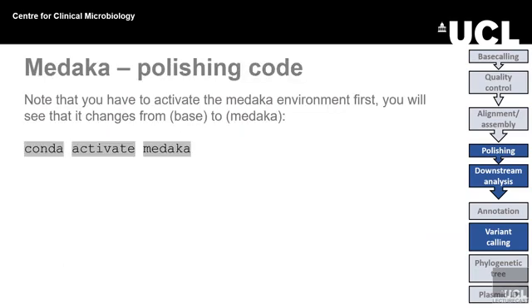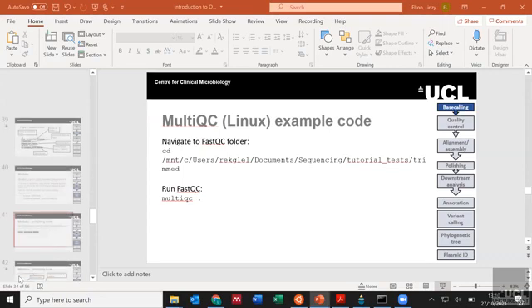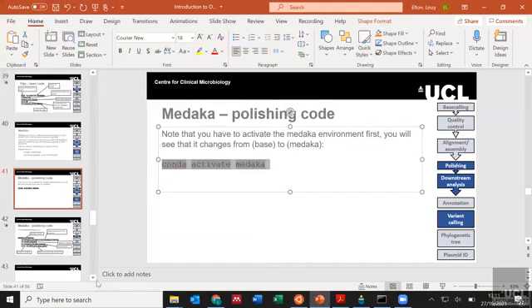For Medaka, you have to activate the Medaka environment to run it. So if I just show you, you can see here that base means I am within the base environment. But if I change it to, hopefully, conda activate medaka, oh, that's not what I asked.